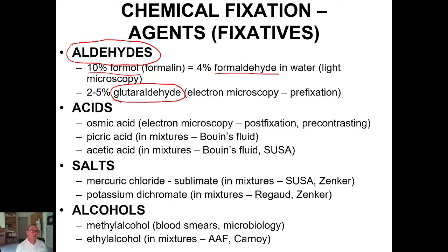That's why the specimens for electron microscopy have to be very small. But when penetrating, it fixes the tissue very well without formation of artifacts like in formalin.